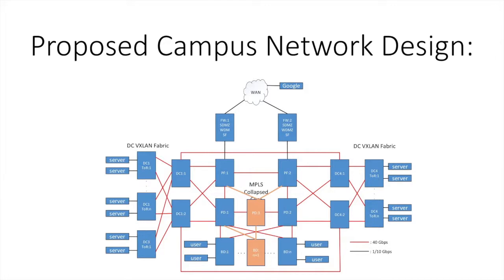I just wanted to end with one of the things that taught us, though, is that we can't do that forever, right? We can go to a CryoEM facility and say, okay, we spent X million on a microscope, we can afford to pull a piece of fiber along with it, but there are so many high data rate instruments being delivered to labs, and we can't pull fiber to every single lab. So what this actually caused us to do was embark on a campus-wide complete revamp of the network.